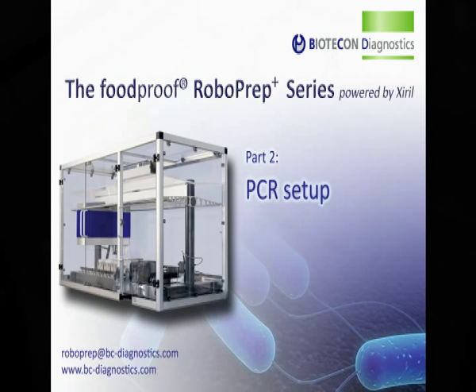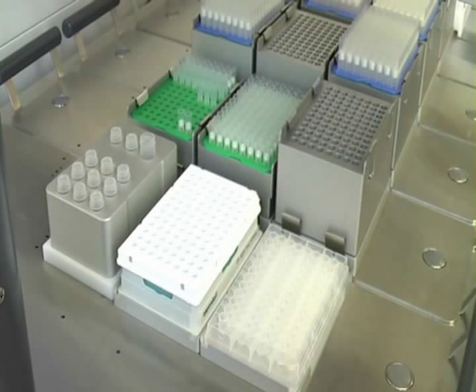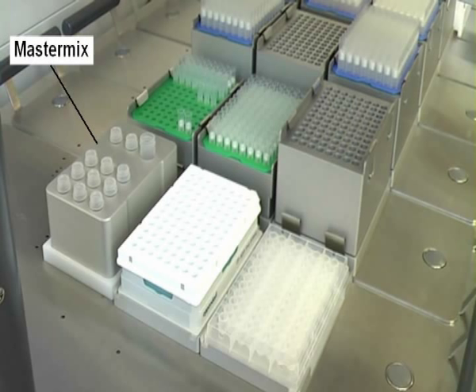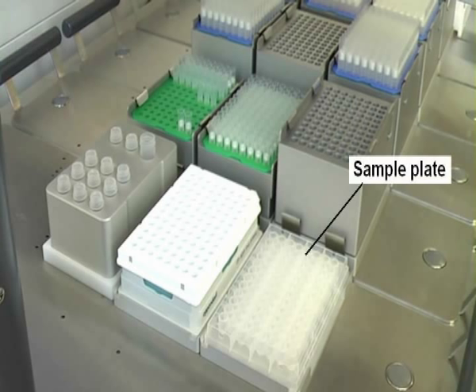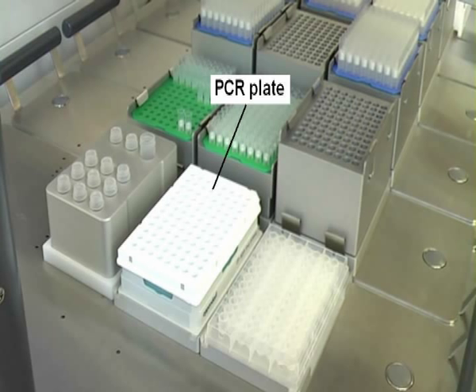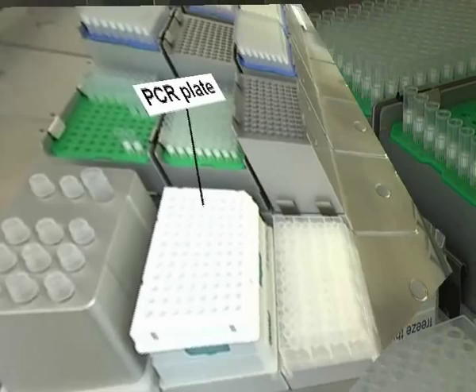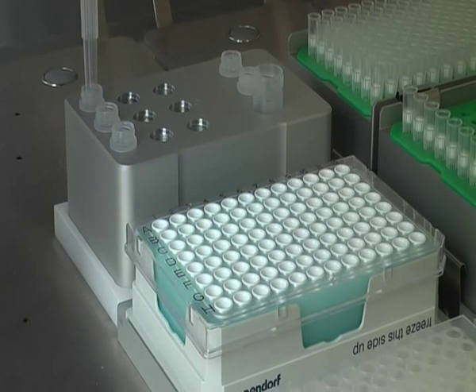The PCR setup protocol starts after the purified DNA from the DNA extraction has been eluded and transferred to the final plate. All necessary reagents for PCR are included in the food-proof Salmonella Detection Kit and have been placed in the PCR setup block. These include the master mix, enzyme solution, internal control, the positive control as well as purified water for the no-template or negative PCR control.